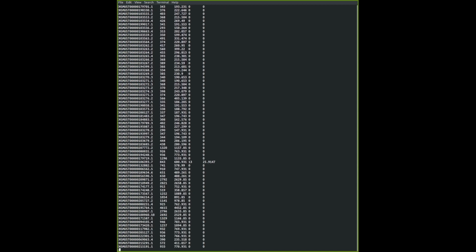You do also have this issue with what is it called? Dropouts. So dropouts basically means that the sampling of your RNA is different for different cells. So you have higher dropout rates, and you don't have all RNAs, all transcripts being sequenced at an equal rate. So it's very common. So you can see now we see this transcript having 13 reads, and this corresponds to about 25 transcripts per million. Okay, you do start to see some data coming up here.